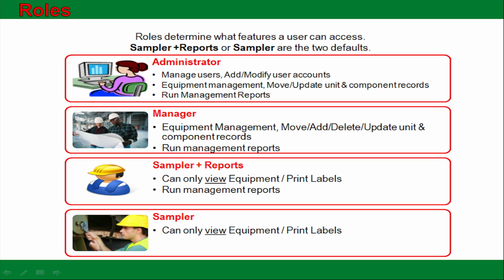The manager role, on the other hand, has the ability to add, modify, or delete equipment. We recommend that at your company, to best monitor your database, a single person or a select number of people are assigned the manager role. Finally, the admin role has complete access to the system, including the ability to add users from the admin tab.